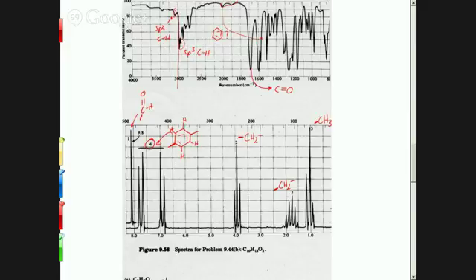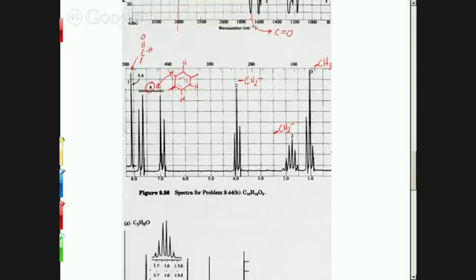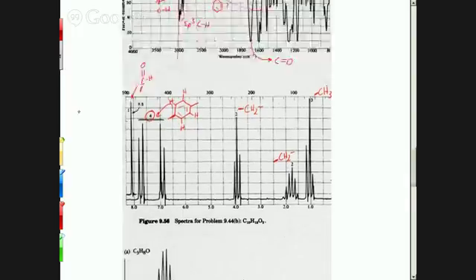So it's not splitting? Right. So I'm kind of running out of space here. Let's turn it around just so we have room. So we know that that's likely to connect to that ring. So now we can make that piece. All right. Let's look at the other side now. We've got two CH2s and a CH3. We need to know if we have to connect them all together or if we have to put something else in there. How can the splitting help us to determine that?